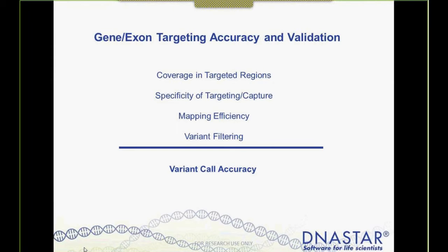And so this is what we'll look at in the software, because this is some of the stuff that you can't do in a lot of other softwares. The other softwares do not give you access to the intermediate steps. You essentially run an assembly, you get a VCF file, but you don't get anything in the middle to really evaluate and interrogate where you might have loss in your accuracy.